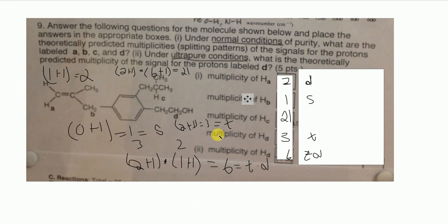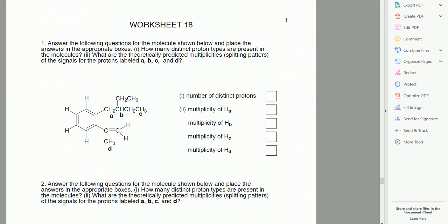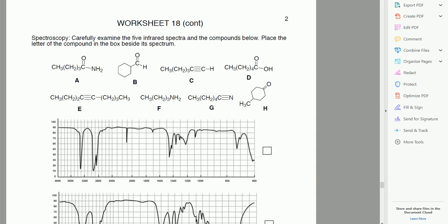It's just you're looking at the environments. We're using the hydrogens around everything and all the things to figure out everything that we need to know about this molecule. All right, and it pieces together like a puzzle, right? And it'll make a lot of sense once you combine this with IR and we learn some other components of how to figure things out. Okay, so I'm going to jump now to an actual problem, and I'm going to use the workbook for that.